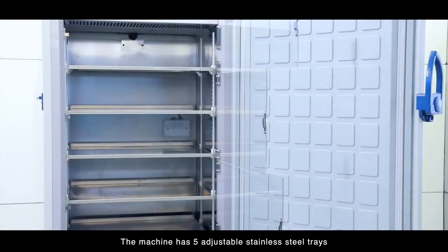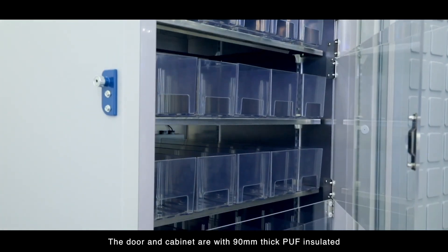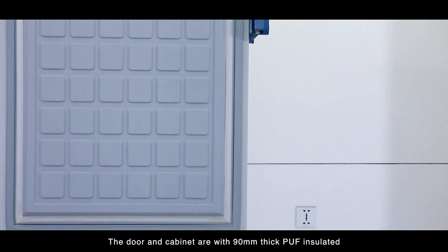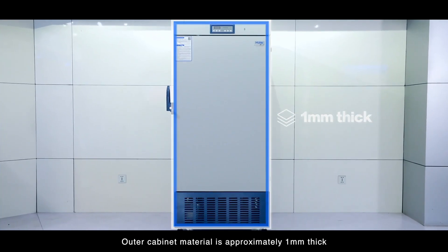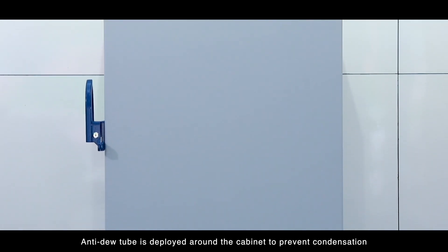The machine has five adjustable stainless steel trays, five compartments, and three plastic inner doors. The door and cabinet are with 90 millimeter thick PUF insulated with rubber gasket sealing. Outer cabinet material is approximately one millimeter thick. An anti-dew tube is deployed around the cabinet to prevent condensation.